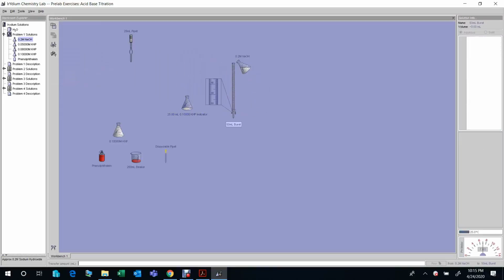There's one thing. Before I do the titration, you see the reading, the scale here is 40, 50, 40, 30. So for a 50 milliliter burette, the 50 scale, the reading is over here, at the bottom, not at the top. So we need to keep this in mind.